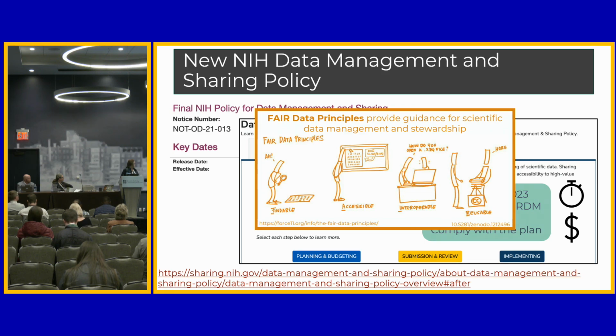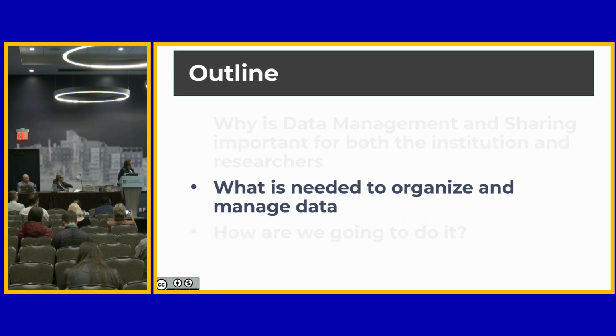And in this context, I'm sure all of you know, but I want to remind you what FAIR is: findable, accessible, interoperable, and reusable. All of this is about future-proofing your data. But it's not just for posterity or for another person and being a good citizen. It's primarily about finding it for yourself and organizing it for yourself, so that you can get more impact from your research.